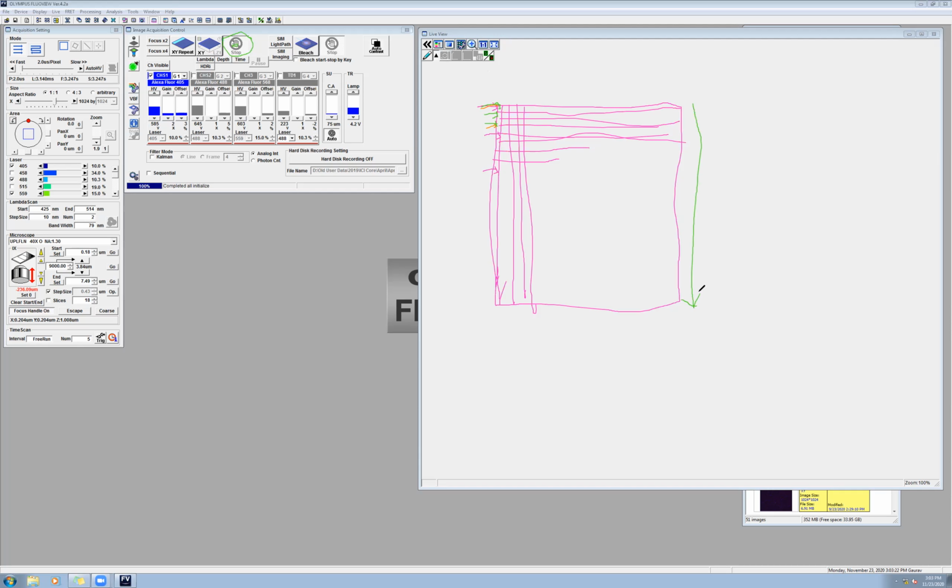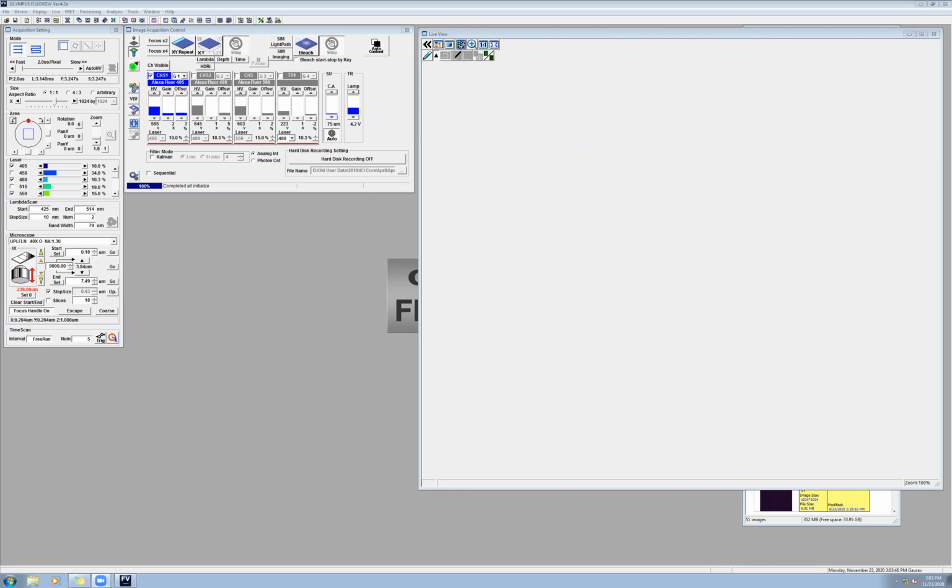So it depends on what you really want to do. You can select either of the options. And once XY scan scans and stops, it gives you an option of saving the image. All right, so we'll be working with these 3 things. Try to look how it's going to look like.